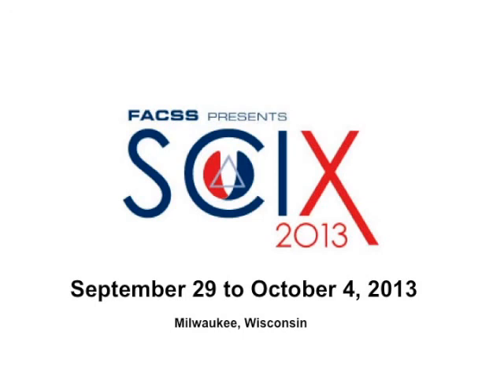Fantastic. What are your next steps in your work on TERS? Well, to boldly go where no one has gone before, right? I want to push towards the ultimate resolution that one can achieve with this technique. I don't know where this ultimate resolution limit will be. There is electromagnetic theory, which tells us it should be in the range between, let's say, 2 and 5 nanometers. But there is also the chemical contribution, where one has direct chemical interaction of the metal tip and the sample molecules. So this might even push the resolution much further. And my dream is still to do a direct sequencing of DNA or of proteins.